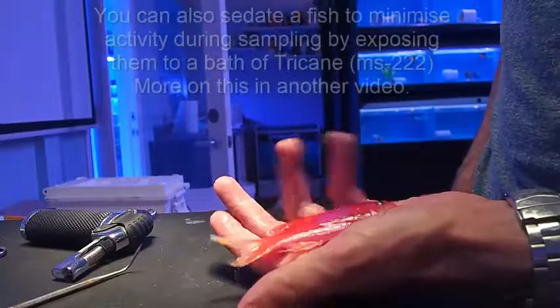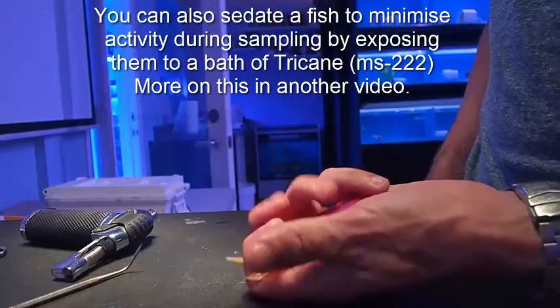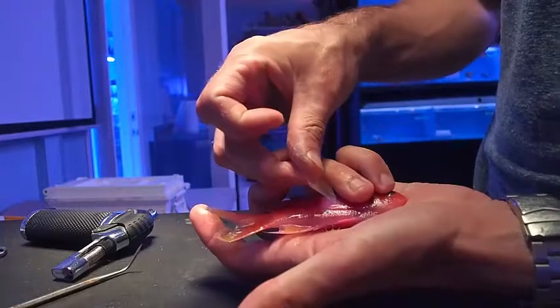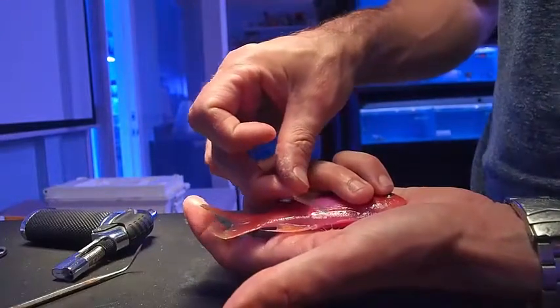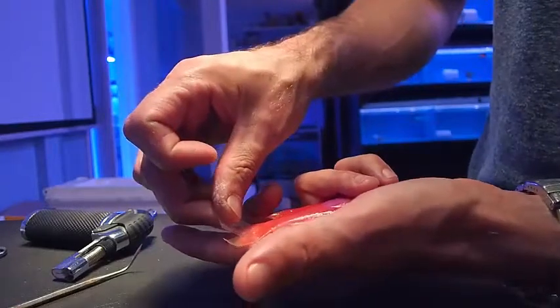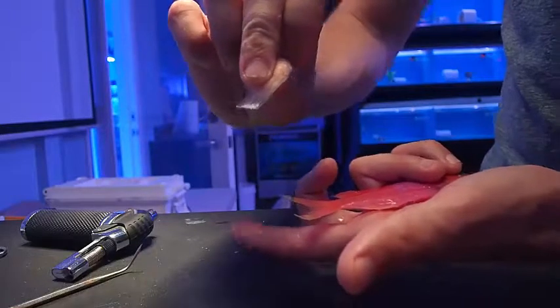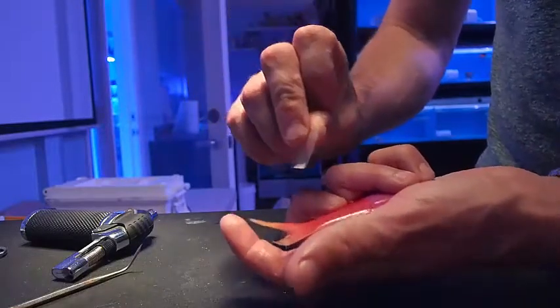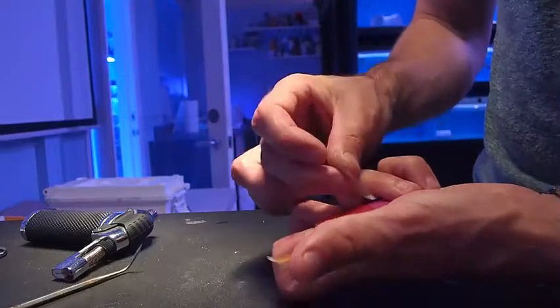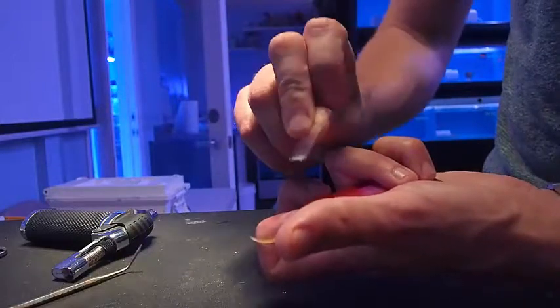Unfortunately this fish didn't make it, but the best way to hold the fish is like this, and then you're going to run the slide at 45 degrees along the body of the fish. If you can actually scoop up off of the tail for mucus, that's ideal. Often fish get a little bit irritated when you do this and start to flip around, so if you have to just bail along the side of the body, just try to scoop up enough mucus.